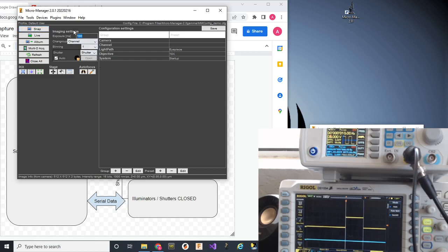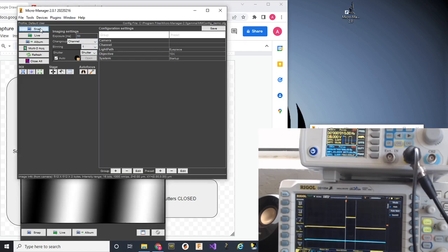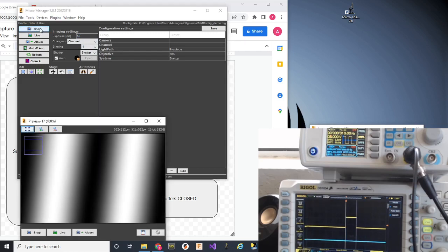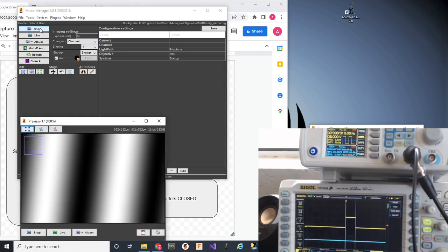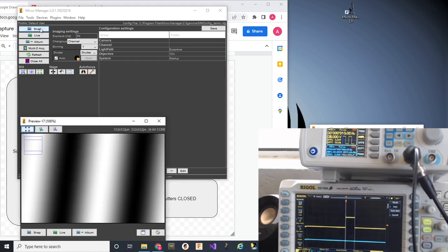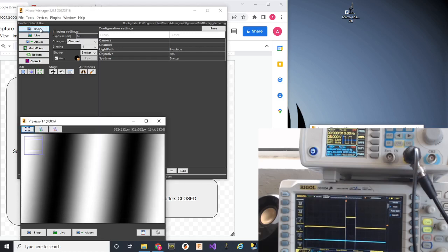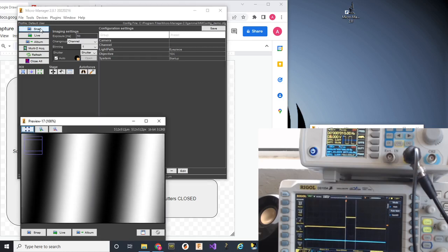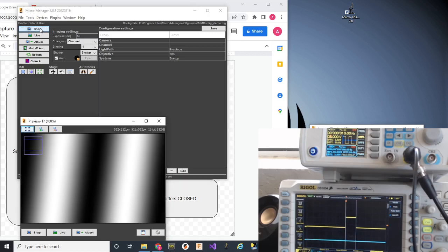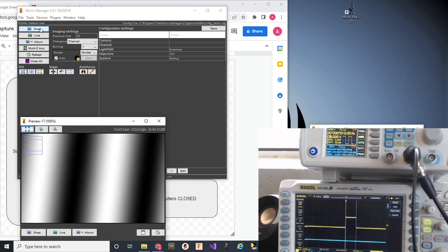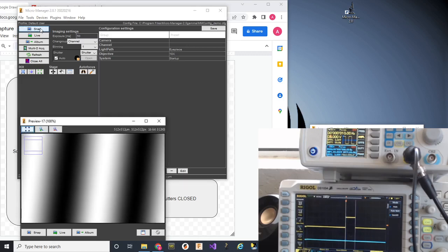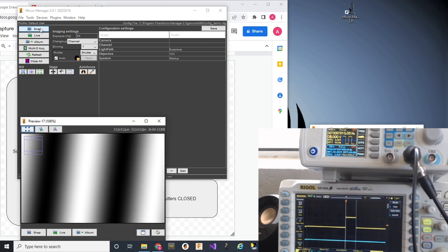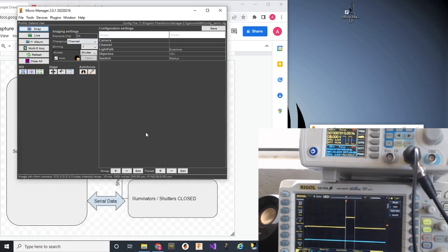Let's bring this down to 50 milliseconds. And we'll snap a couple images here. Here in the time domain, 76, 82. There's a 70. So, as my exposure time drops, this becomes even more important. And the jitter becomes even more important as well.